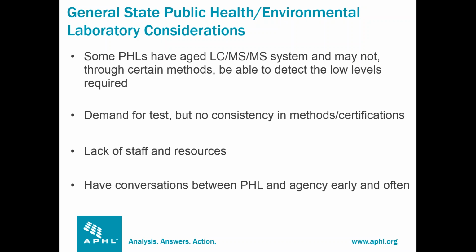Another issue that we all know about is that there's a demand for testing, but there's no consistency in the methods and certifications, and so it makes it very challenging for the labs to go with certainty when taking this on. Of course, the lack of staff and resources, because PFAS are unregulated, many times public health laboratories can't have staff fully devoted to this work, but the work might be done by contract workers or visiting scholars, which can have an effect on the continuity of that testing within the lab.